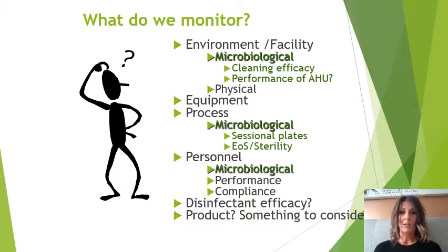We could also consider testing our product. So as we mentioned, we can't test our final product at every stage because we have to take that straight to the patient for administration. However, we could consider sending off products that have not been used, so returns, waste products.